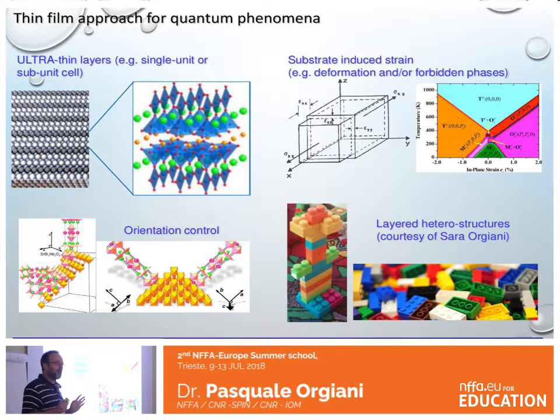First, we spent the morning talking about thin film. So first of all, why are we interested in thin film? As I keep on repeating to everybody, it is not to compete with people growing single crystals. When you want to investigate a specific material and you are so lucky to have a crystal, just go for the crystal. It's way nicer from a structural point of view and so on and so forth. But you need the thin film approach when you want to explore the very thin regime, basically one single atomic layer of any material. This cannot be done by crystals. They will simply break.